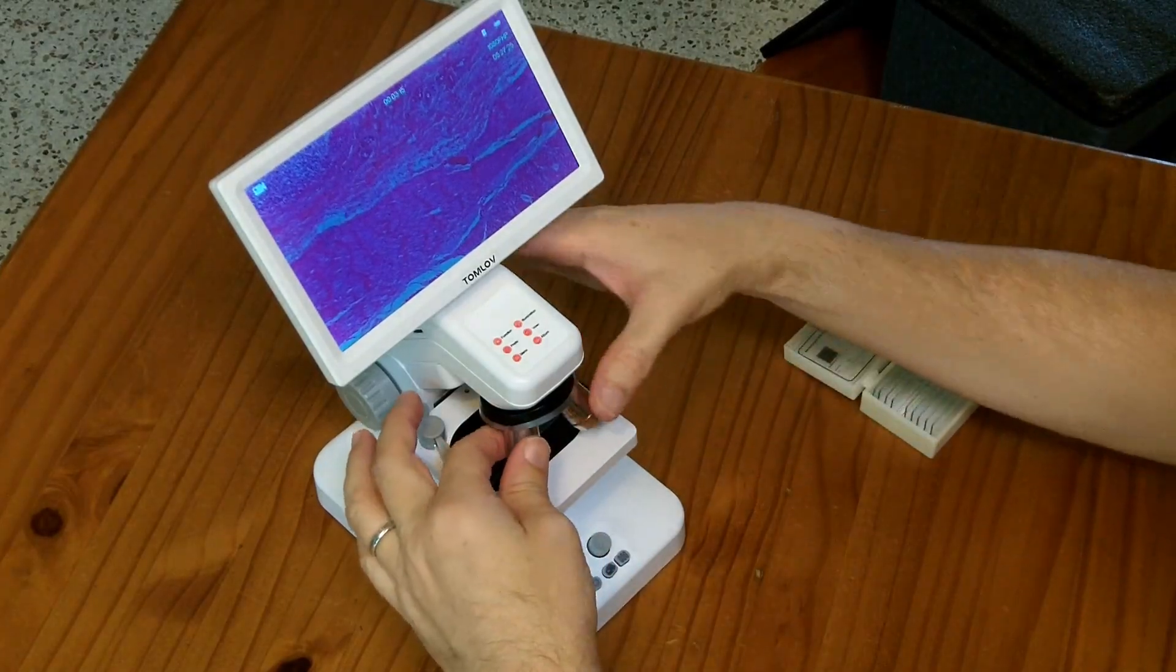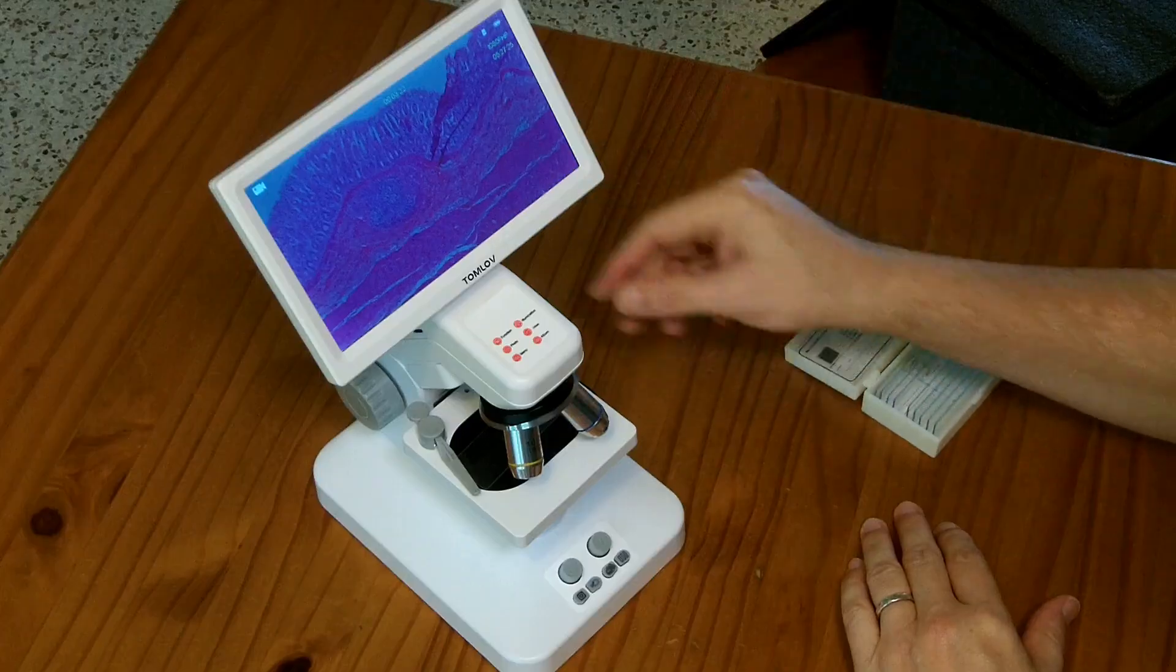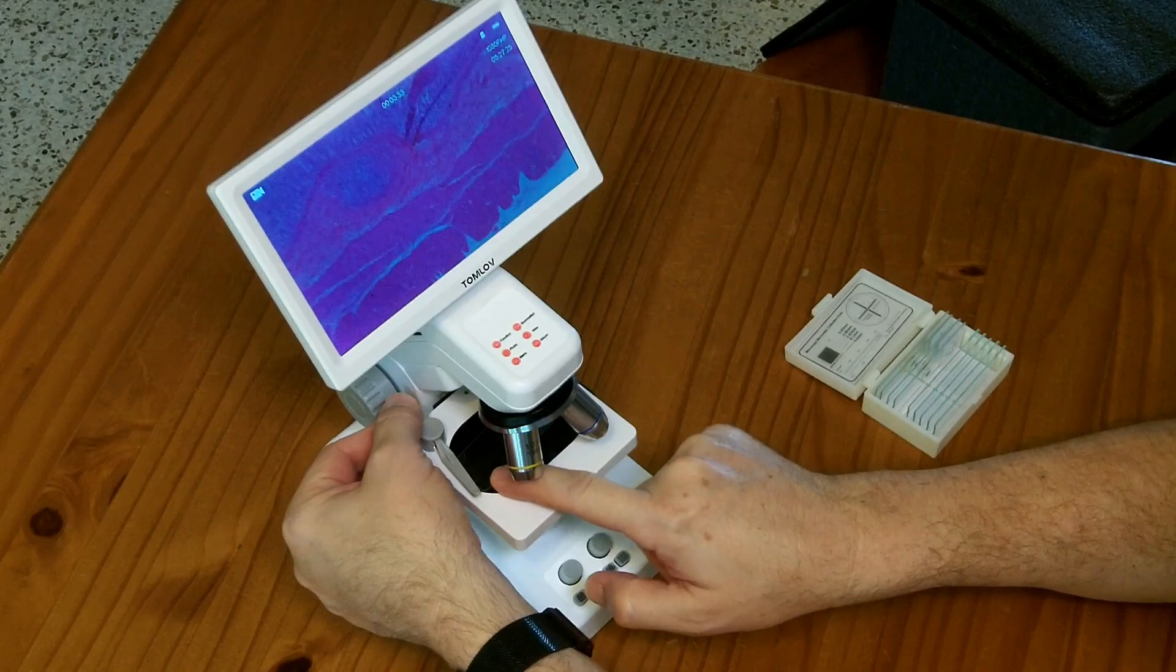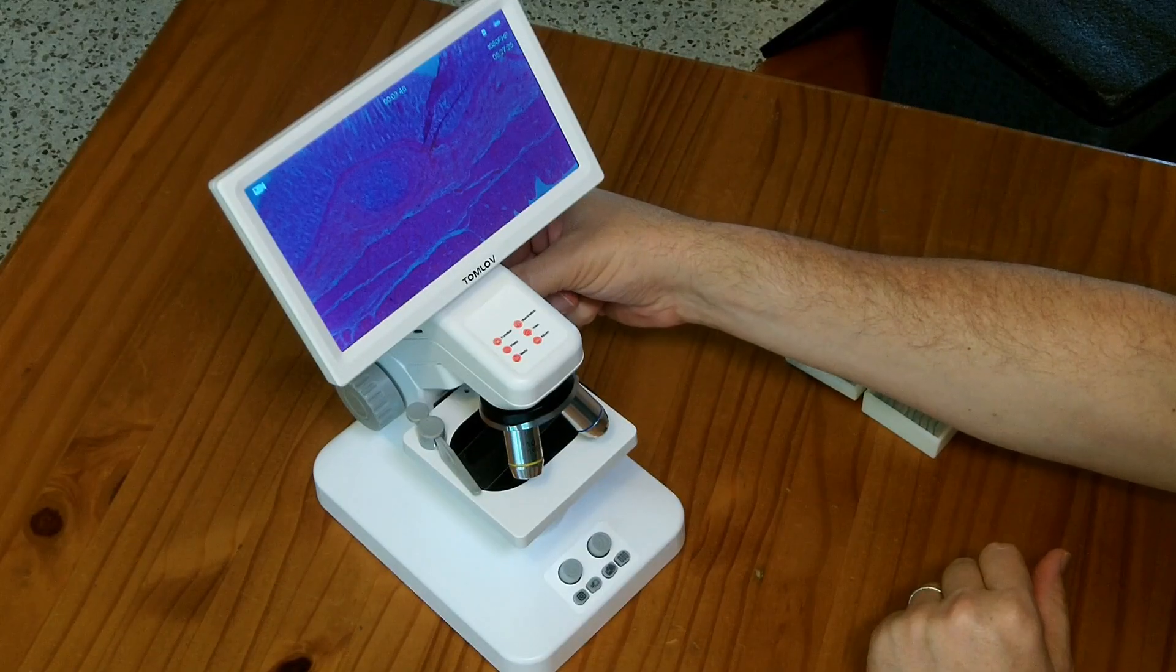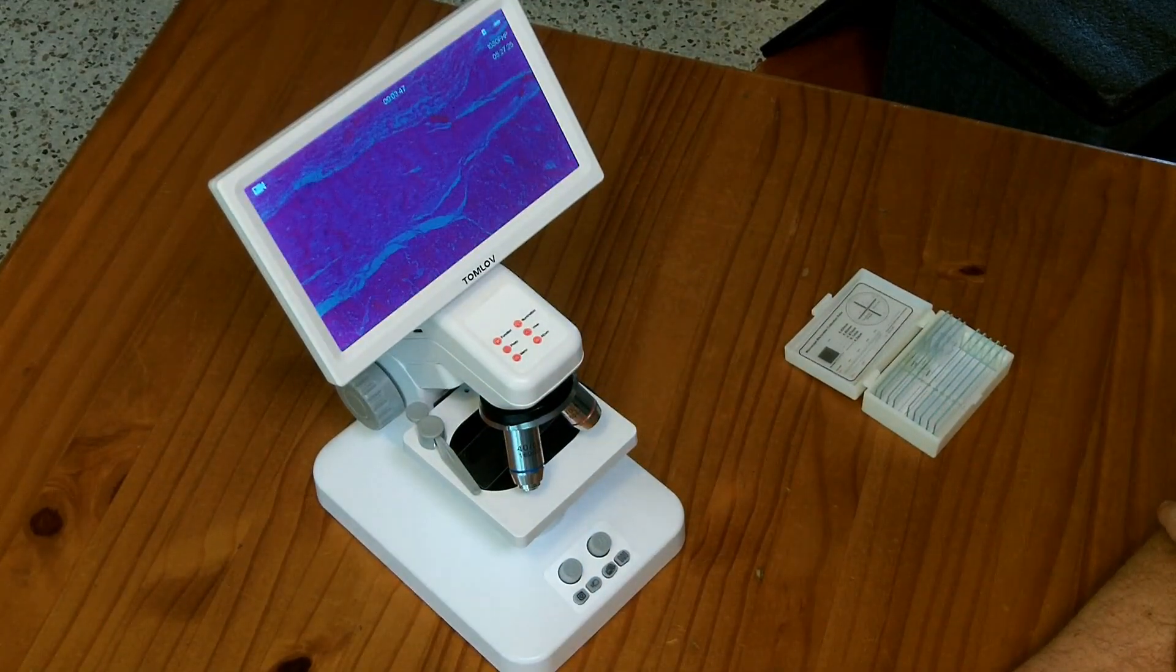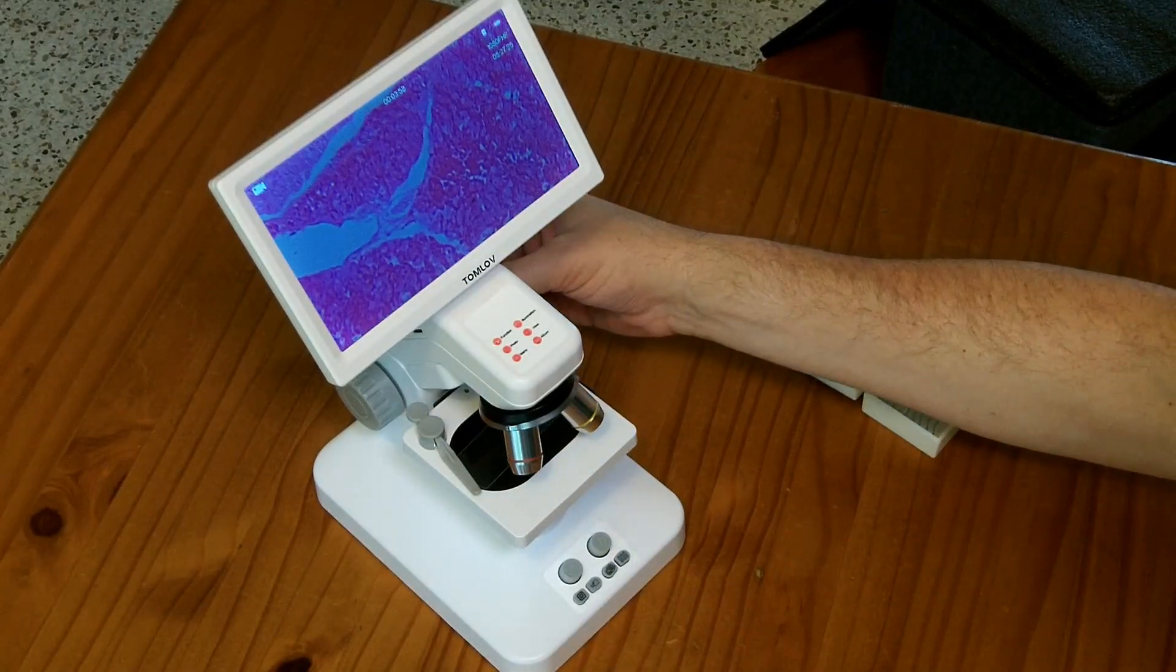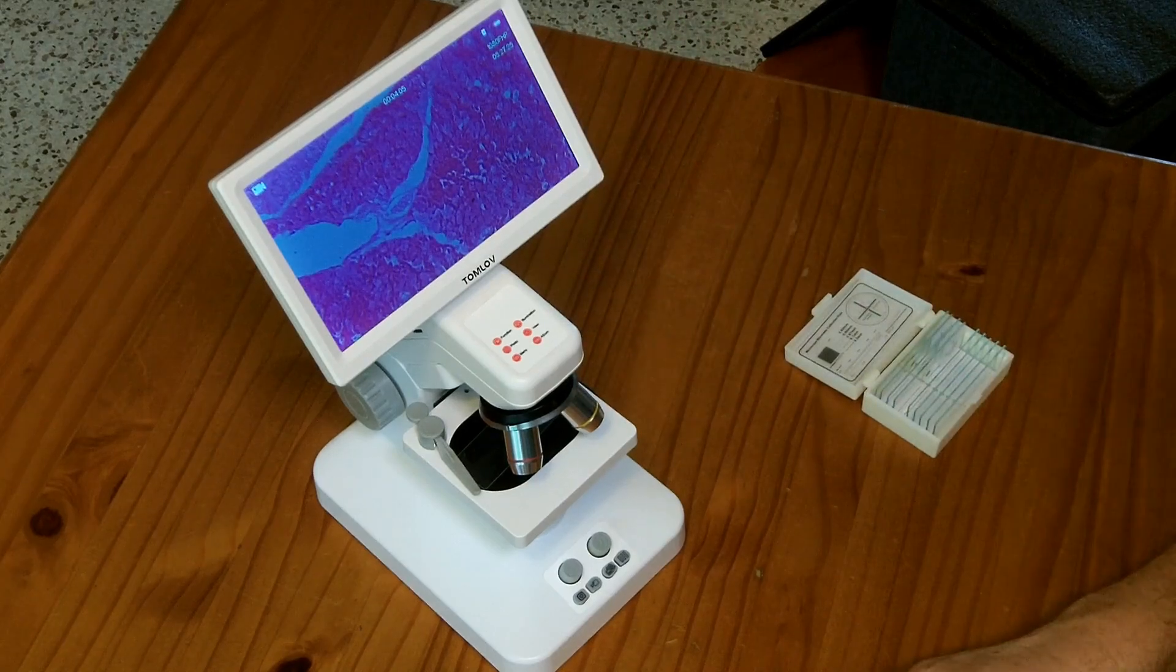Now, we do have other magnification levels optically here. So when you change the magnification level optically, it looks like it's parafocal. It stayed in focus there pretty well. So this is the lowest magnification. We have a pretty good view of a lot of the sample. I'm actually seeing the top edge of the sample here. We're going to move that up. We're going to see the top edge or bottom edge of the sample there. Practice focus here. So I'm going to go up to the next level. So this is the zoom level we were at before. And I'm going to go to the maximum zoom. So it looks like it's doing a pretty good job.